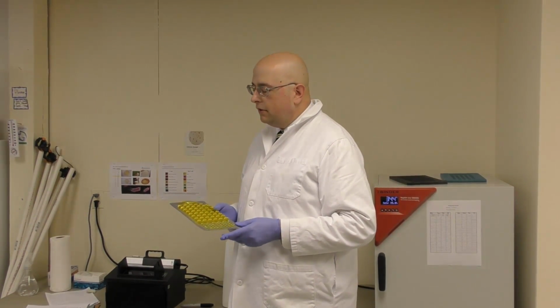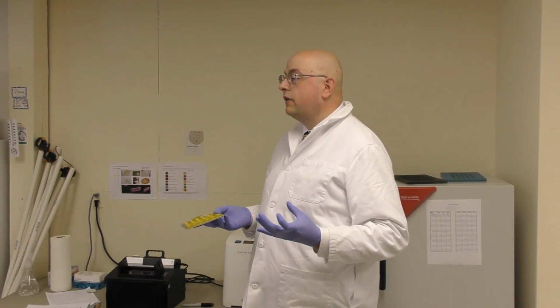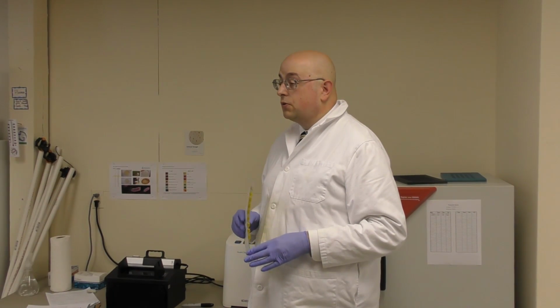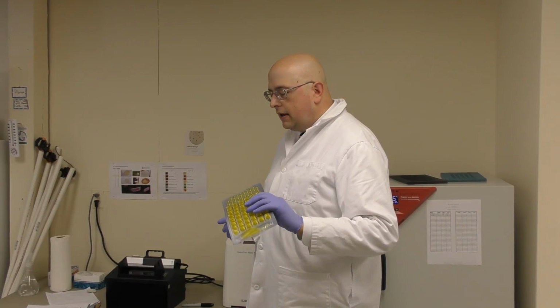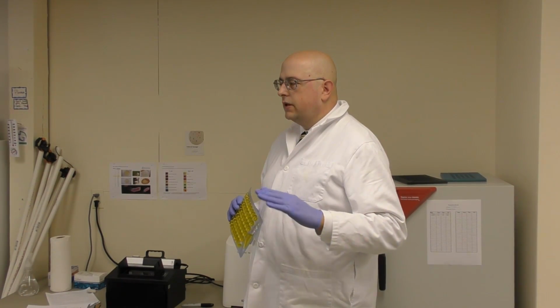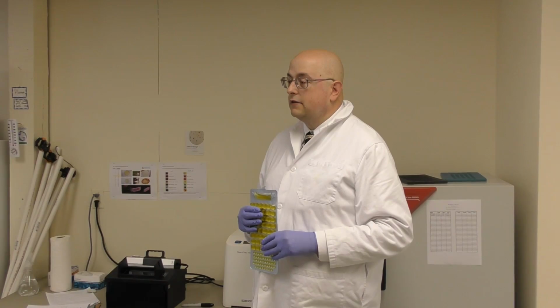If you have the ability for, say, biohazard type bags and that type of stuff, we recommend you do that. If you've got that type of pickup, try to avoid putting it in general trash. But it depends on what your resources allow for that. But generally speaking, most of the stuff that's growing in here is E. coli or coliform bacteria. There should not be as much of a risk of pathogens as maybe some other methods, but there's still that potential chance.